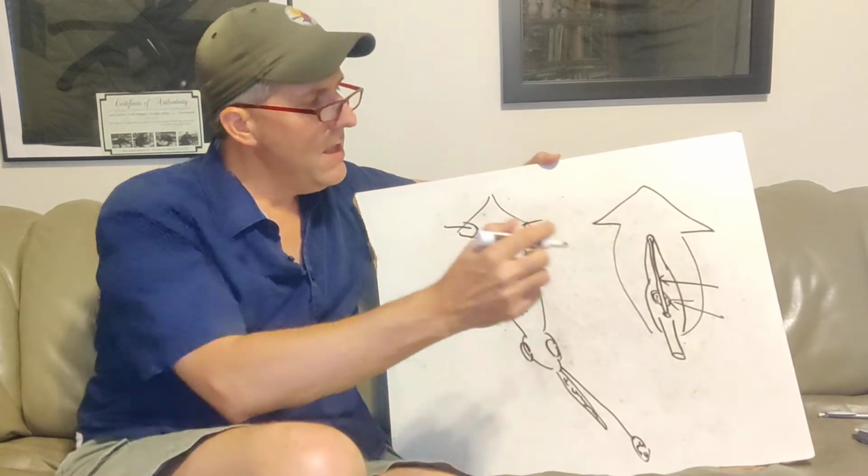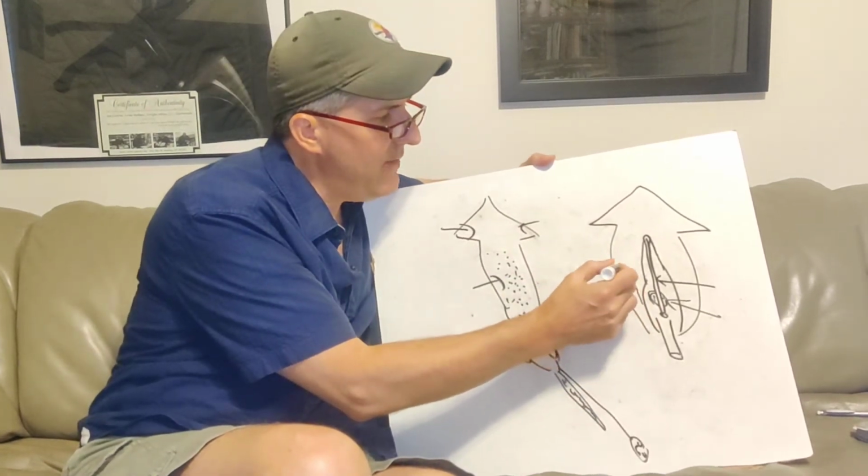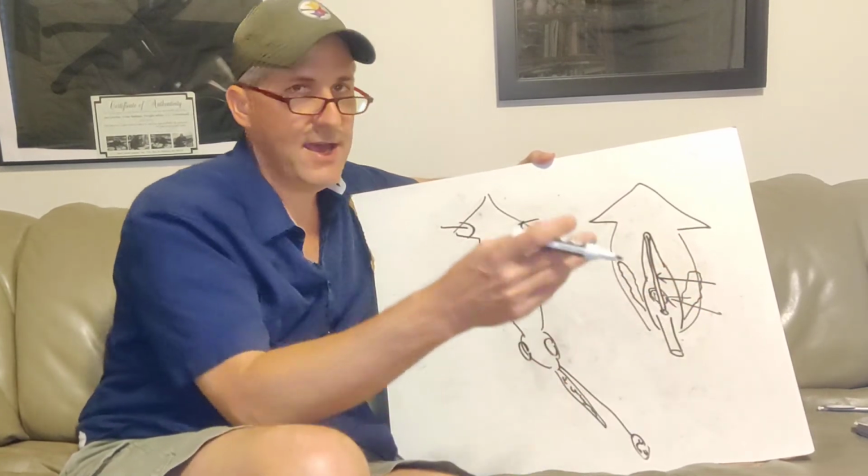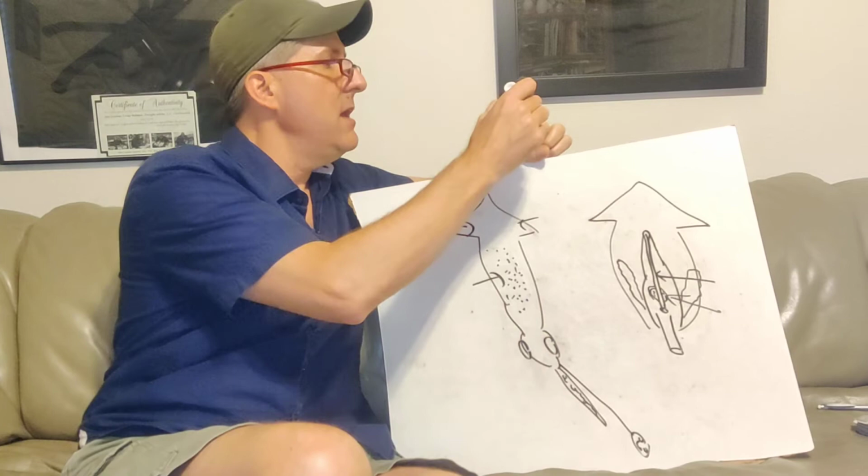Now, on this side, then, you would have a feathery structure. That's 1 ctenidia. On this structure, on this side, you have the same thing. Another ctenidia, 2 gills. Different color.